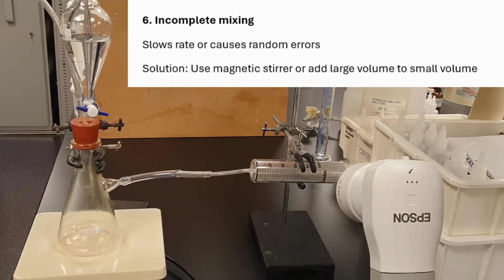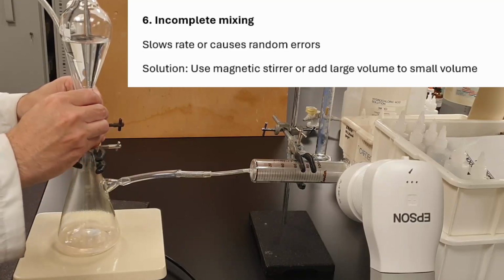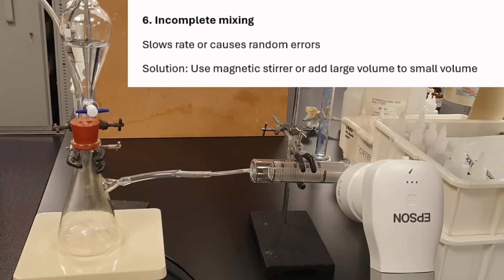I'll explain that in the next bit, the volumes and concentrations. It would have been better to have put a large volume into a small volume for the mixing. But you'll see later I've already committed to my concentrations and calculations, so I'm not going to change at all. And these were the chemicals that I could just grab off the shelf, so I wasn't going to spend the time making up specific volumes for that.